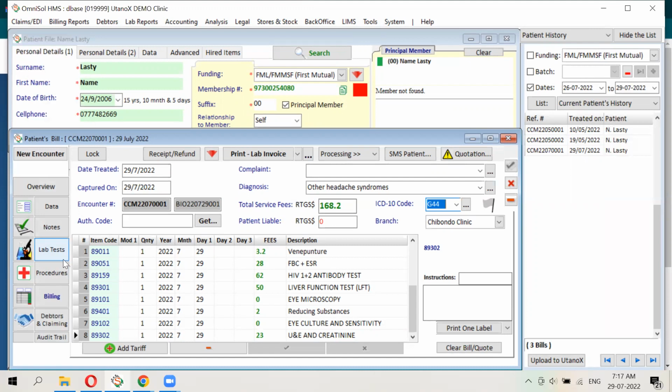Each and every test that is in that liver function test is claimed as an individual test with its own ICD-10 code. Yes. In fact, the system is built on that assumption, because that's probably how it is in many regions. So, okay, fantastic.